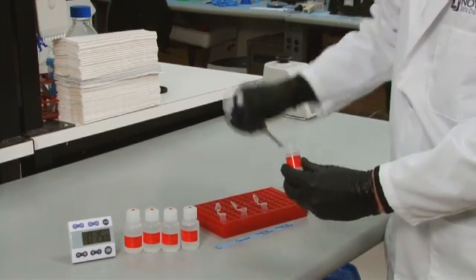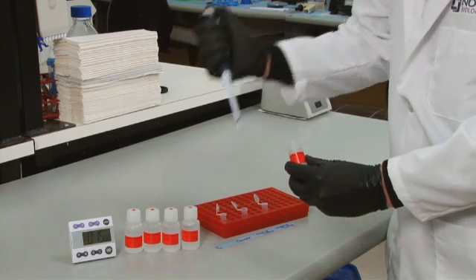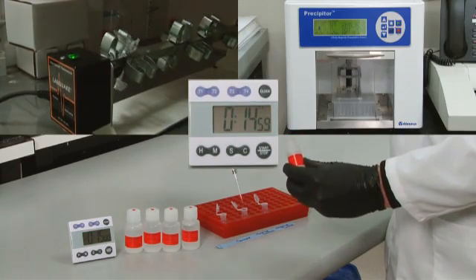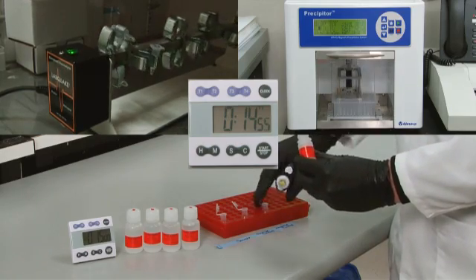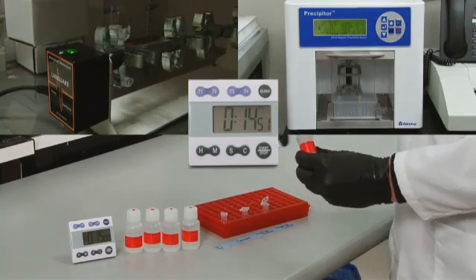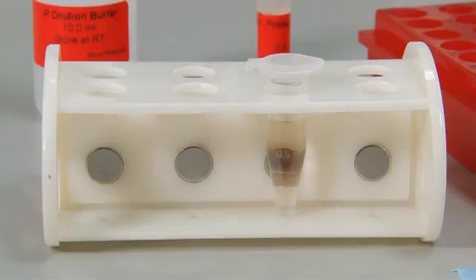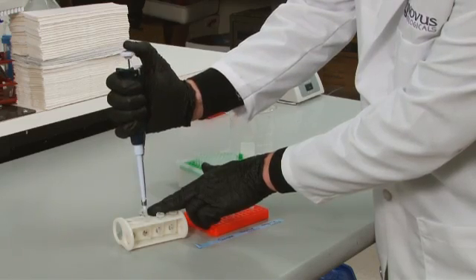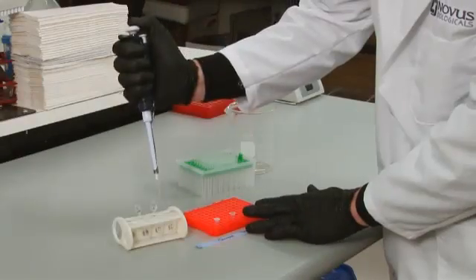Elute the complex from the beads by adding 200 microliters of IP dilution buffer and washing for 15 minutes at 4 degrees Celsius with rotation or agitation. Pellet the beads, keeping the supernatant and discarding the beads.